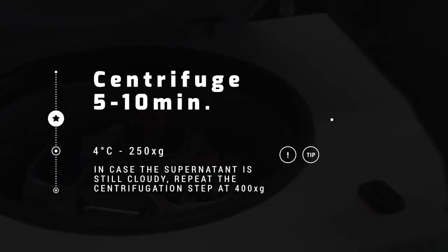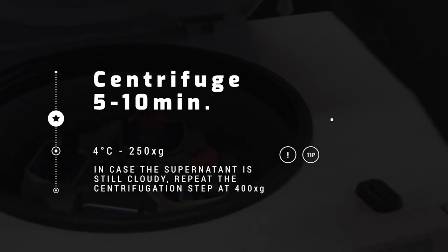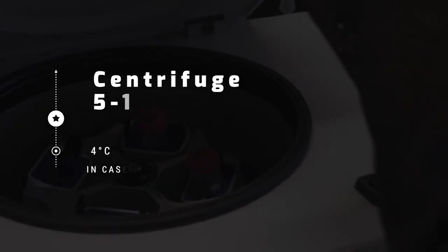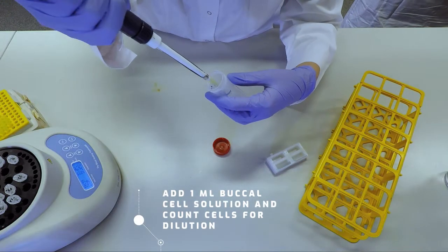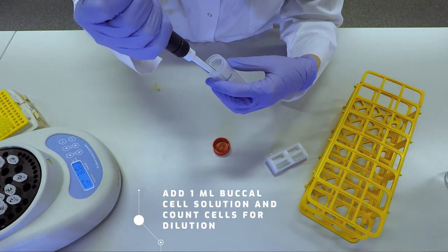Centrifuge at 250 g for 5 to 10 minutes at 4 degrees Celsius. Remove the supernatant, add 1 milliliter of cell buffer, and count the cells if necessary for dilution.